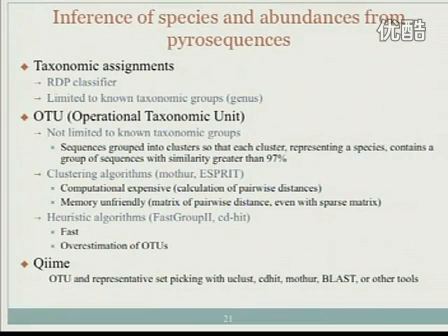Usually you don't go below that because the confidence is not enough. You only have a fragment, and also because the RDP classifier, as I said, is based on k-mer frequency, they don't really do alignment. But if you run BLAST or use other similarity search tools, and this fragment is really from the 16S RNA gene of a known species, you will probably get an almost perfect match. But for this approach, you really limit yourself to the known species.